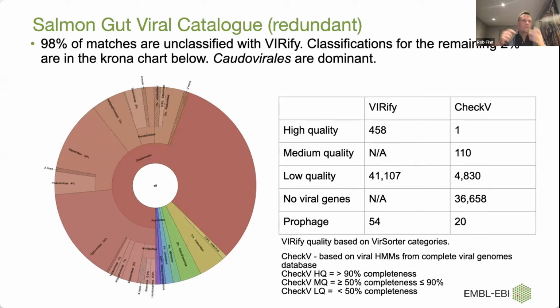So you can't just say, okay, they're completely wrong, they're misannotating. But on the concept of what things are good, what we can see is that out of the 40,000, we're only having a few hundred that we think are good quality viruses. And I think that's one of the key challenges facing the community. And also what you'll see from this Krona chart is that the taxonomic resolution of these diagnostic HMMs is still not wonderful, especially when you go into environments which aren't well studied.